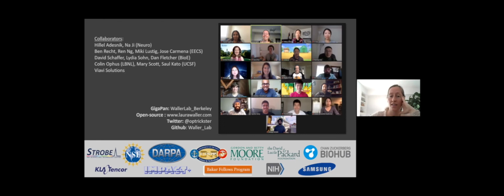And the biggest challenge there is compute, in that we run out of memory. It takes forever to compute these things. These optimizations are so huge that some of them become really unfeasible, particularly for the 3D problems. So we've been playing around with all different ways to try to improve that. Michael Kellman had some nice papers on using, if you can back propagate through the network, you need not store everything, which is really nice. That saved us a lot. It drastically improved the size of problems we could solve so that they're more practical. But we still run into these problems. And right now we're playing around with the solution of just throwing money at it by putting it on Amazon Web Services. But I'm not a big fan of that solution.